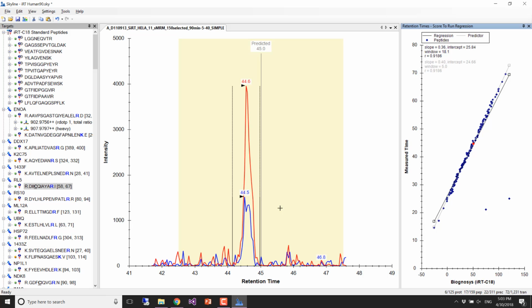So it can be really useful to set some sort of window, so you have an idea that we measured a bunch of stuff, but we don't really trust anything more than 2.5 minutes on either side of our prediction. If the data had actually been collected based on my tutorial, then this would be the measurement window. You wouldn't see the chromatograms sticking out to one side.